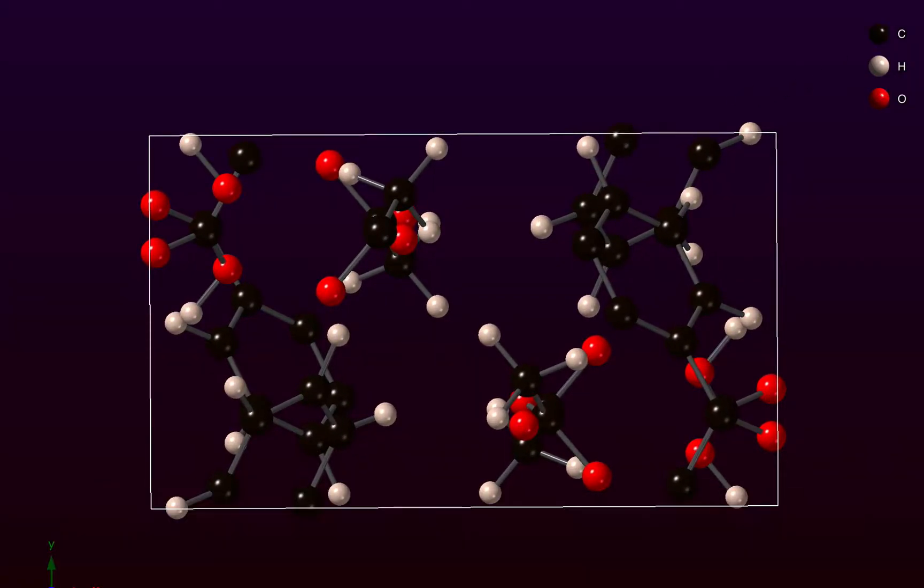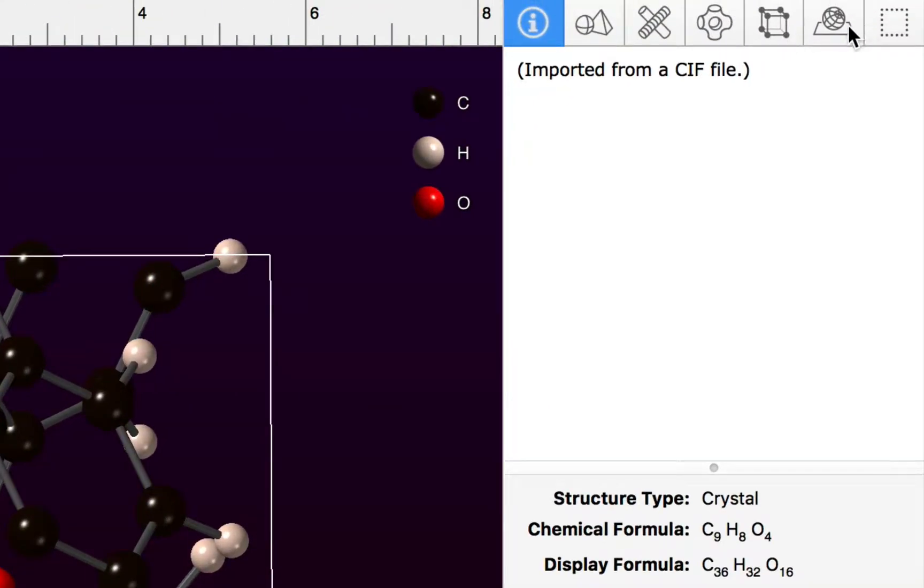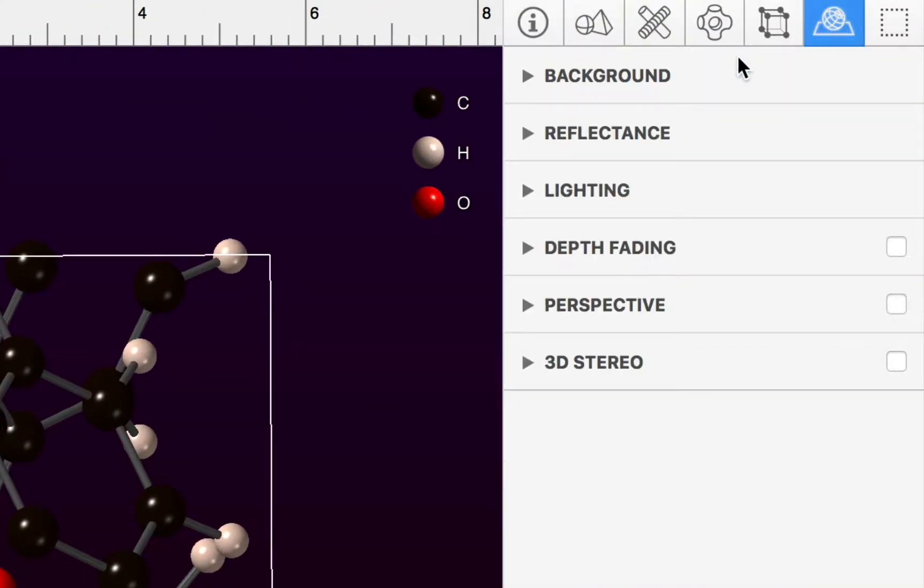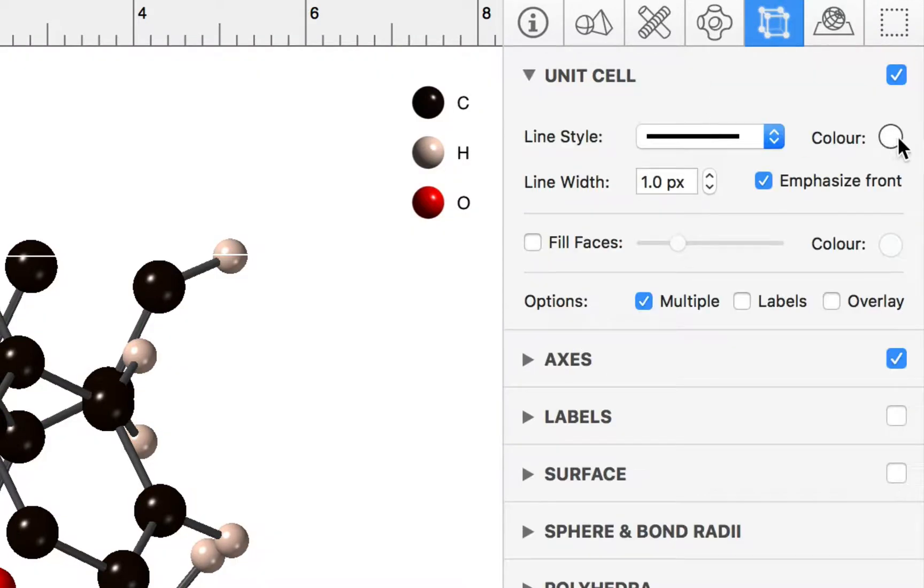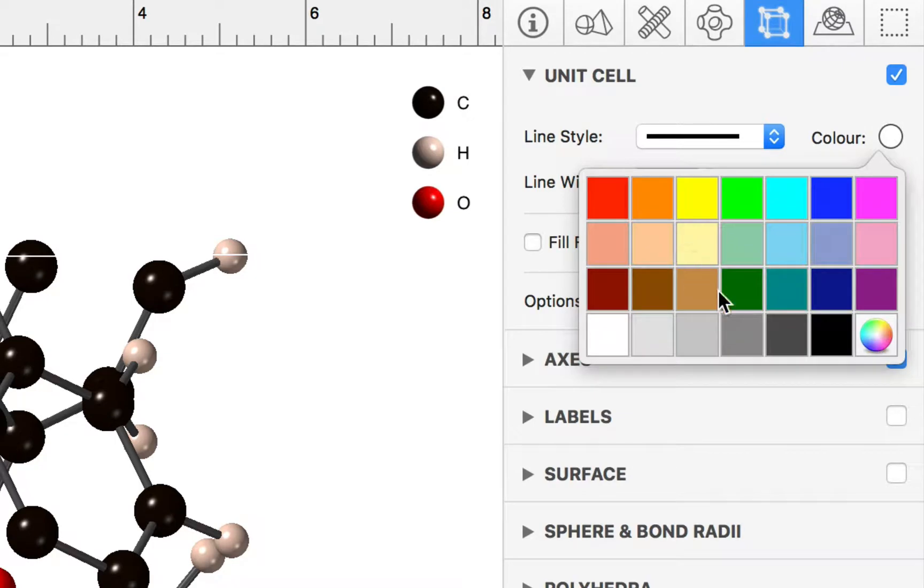The first thing I'm going to do is change the background color using our rendering inspector. Let's choose a white background color and change the color of the unit cell frame using the model inspector.